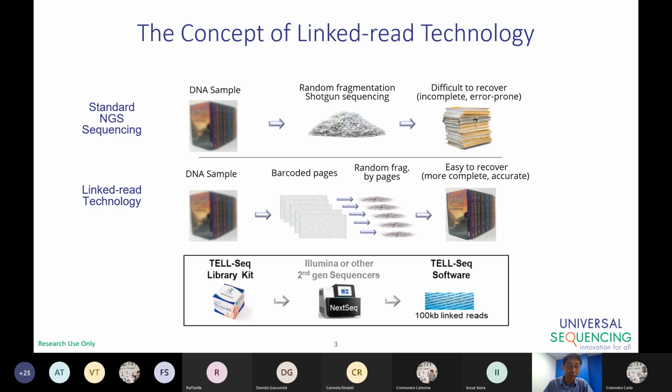For sequencing, the page in our particular case will be the barcode. So we use a unique barcode to label each long genomic DNA molecule, and every subfragment broken down from that long genomic DNA is going to share the same barcode. So that serves as a page function, and it will simplify the assembly later. Again, what we're doing here is just some modification on the library prep. We still use a short-read sequencer to generate the long-read information.